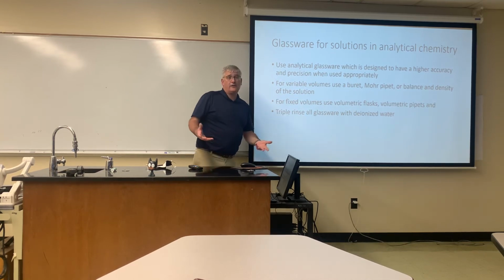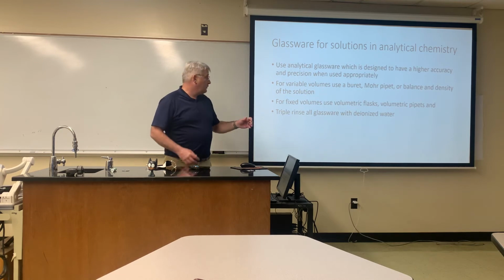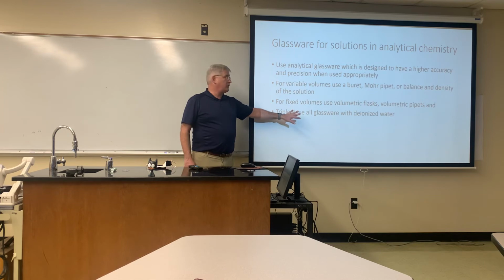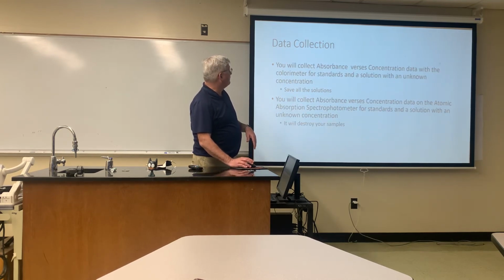Another important thing is to make sure there's no contamination, especially in low concentration standards. We want to make sure we triple rinse all our glassware with deionized water. If there were any residue from a past experiment, we would be sure to remove it. So those are things to think about.